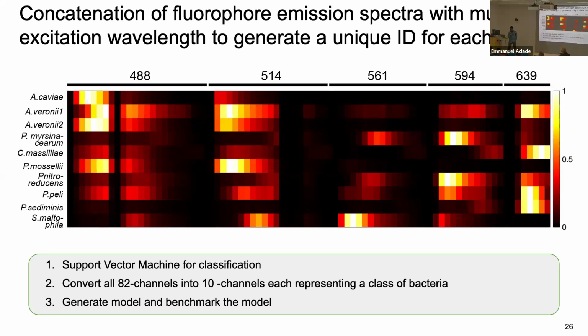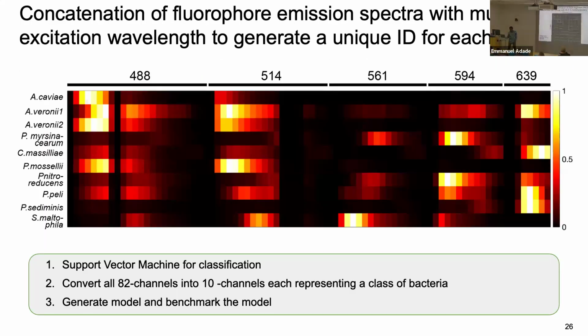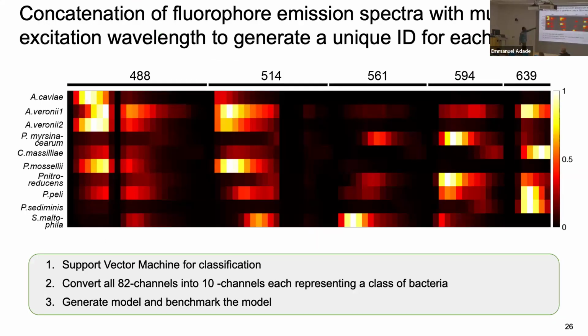What I didn't show you here is that in this community, we have just 9 probes. We use the same probe for every organism; we didn't design 2 probes. We have 1 probe for this, and then 1 for each other. So we have 9 probes, and we're able to tell 10. I think we can design fewer probes, but really take advantage of the signals that the off targets will build up in the cell, so that we don't have a cocktail of probes interacting among themselves.